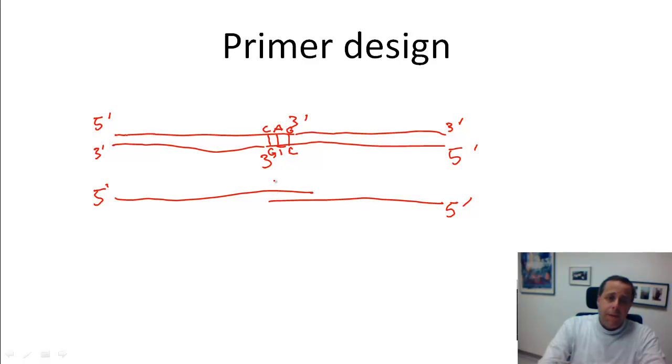What will happen if your primer ends with a palindromic sequence like G, A, T, C and the other copy of the primer will also end by G, A, T, C. Can you see what happens?